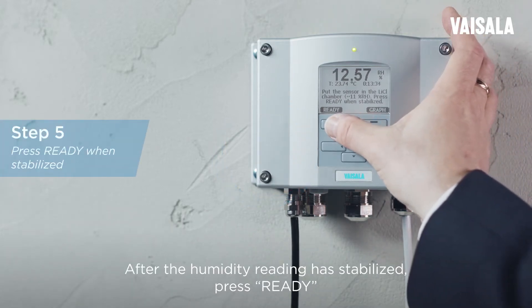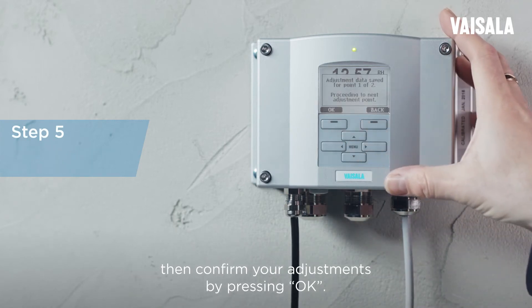After the humidity reading has stabilized, press READY, then confirm your adjustment by pressing OK.